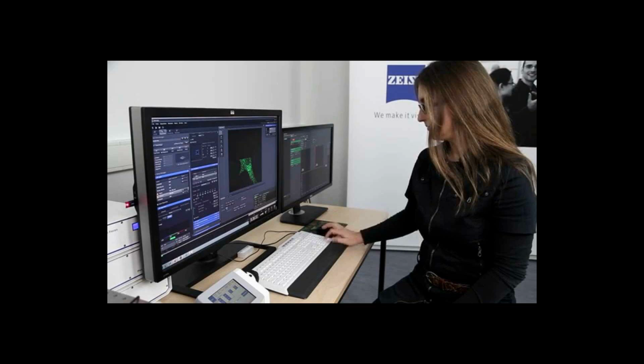In recent years, integrated intensified CCD cameras entered the market. These cameras consist of an image intensifier, CCD sensor and an integrated delay generator. ICCD cameras with shortest gating times of down to 200 ps and delay steps of 10 ps allow sub-nanosecond resolution FLIM. In combination with an endoscope, this technique is used for intraoperative diagnosis of brain tumors.